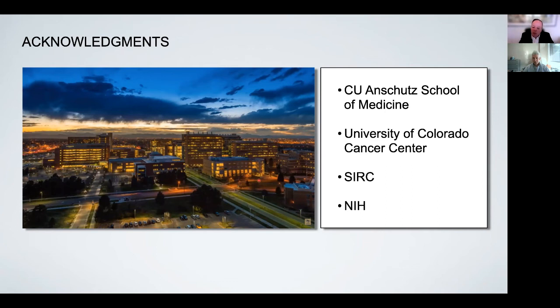So cryo-electron tomography is lower resolution because you have to collect all of your data from a single object, let's say a cell, right? Therefore, you have to contend with the specimen damage. The other way in which they are different is they require slightly different kinds of microscopes. So our best microscope on campus is at 200 kV, the Arctica that I showed a picture of. That is perfect for getting to near atomic resolution of single molecules, right?